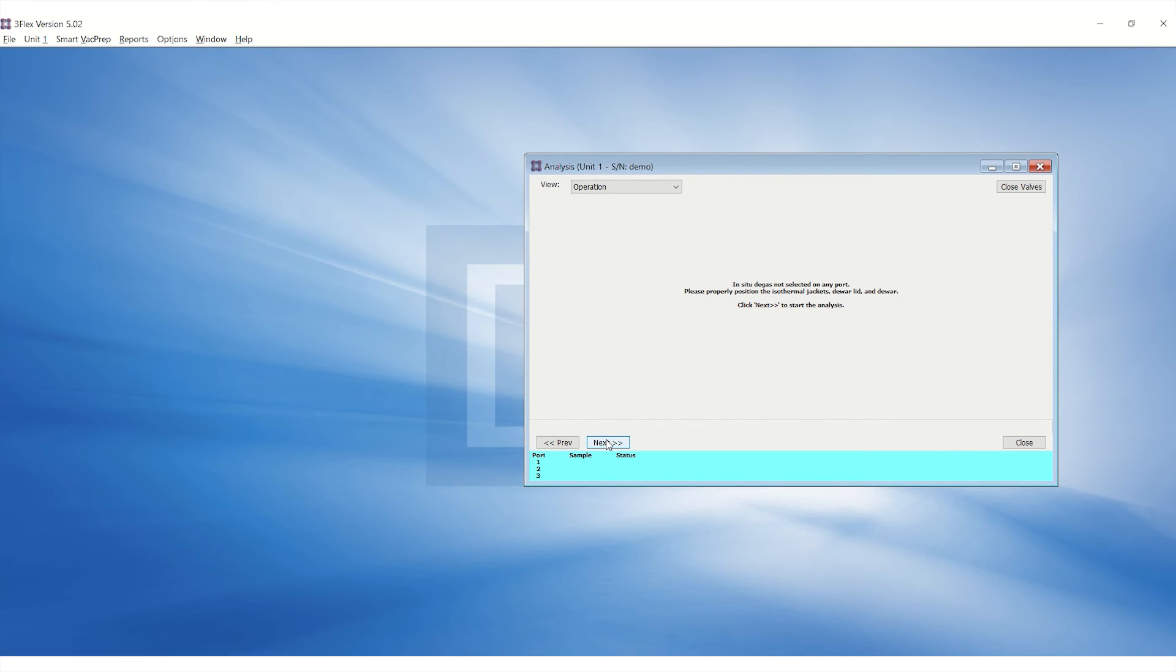Double check if the isothermal jackets are properly in position and click Next to begin the analysis.